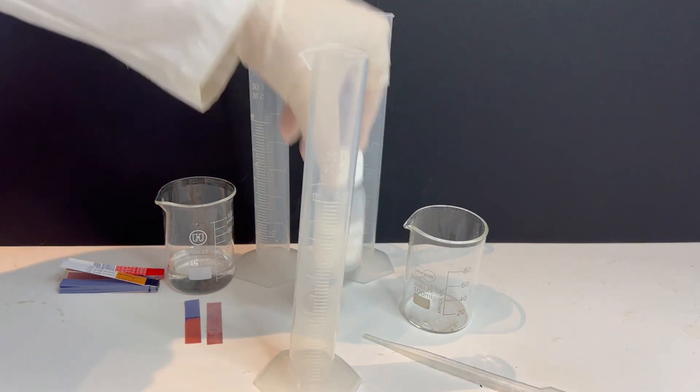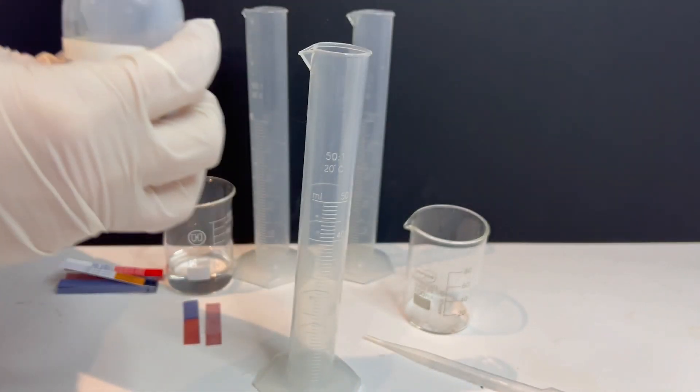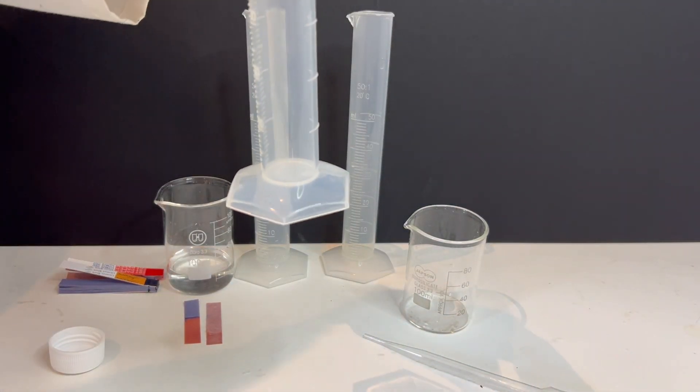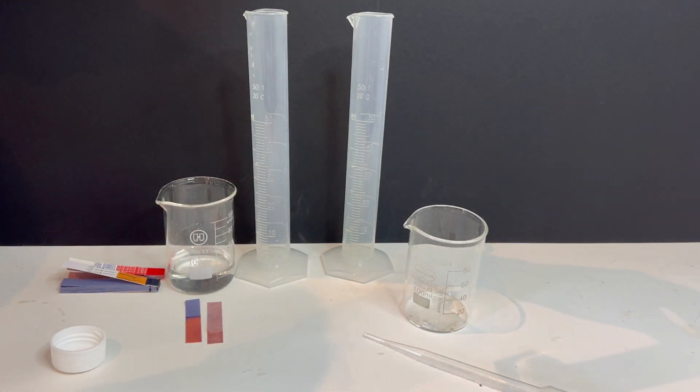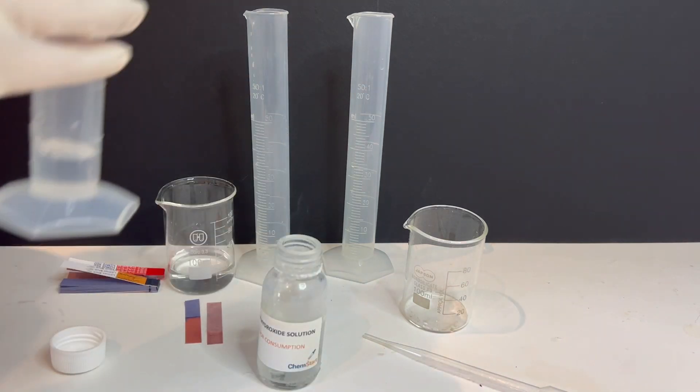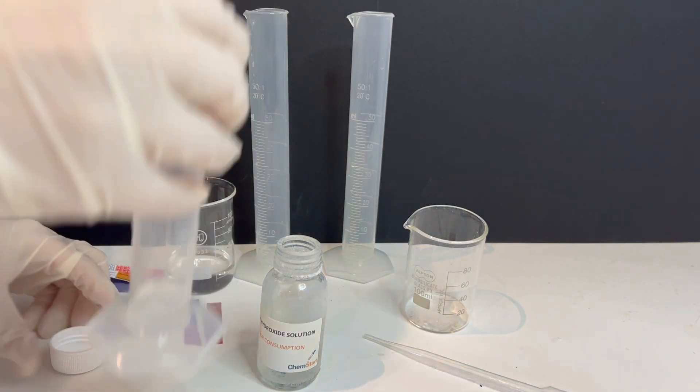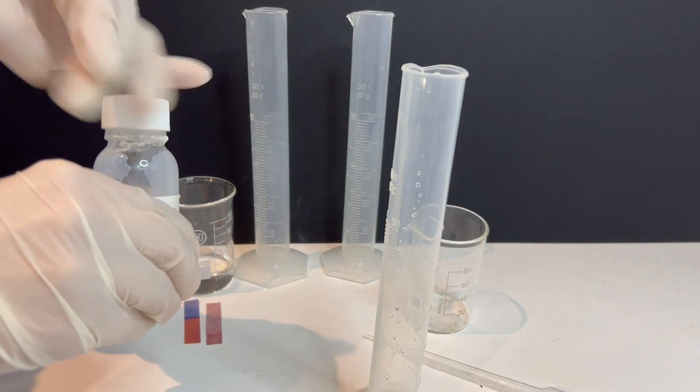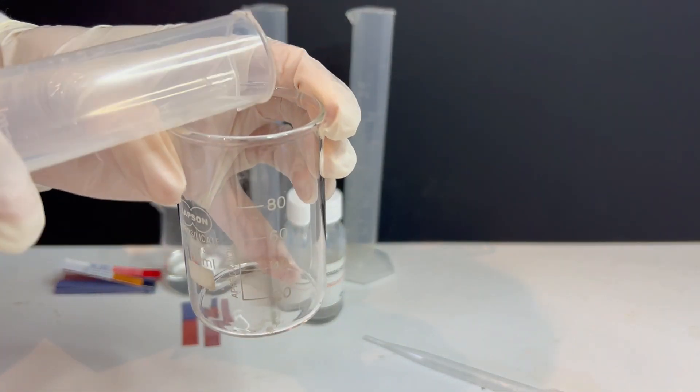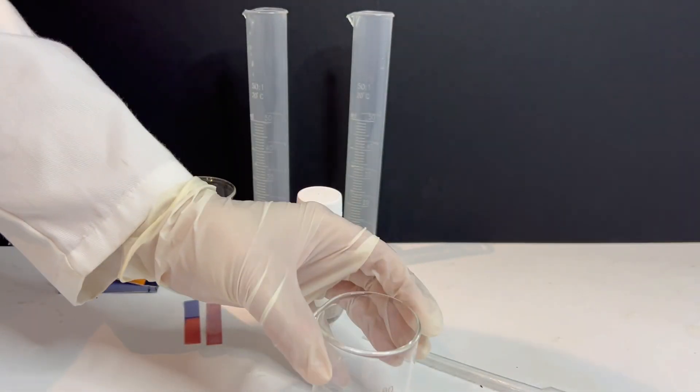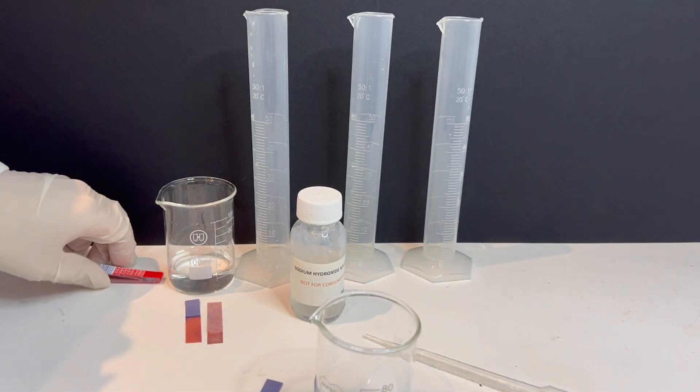Next, I pour about 5ml of sodium hydroxide solution into another clean beaker. Sodium hydroxide is a strong base. I cut two new strips of litmus paper again, one blue and one red.